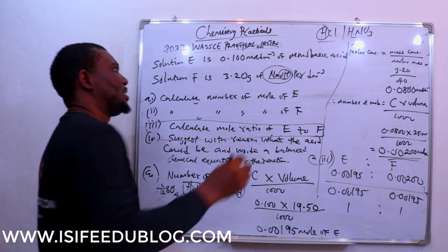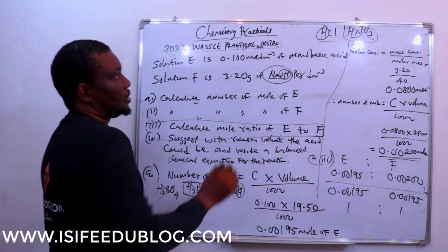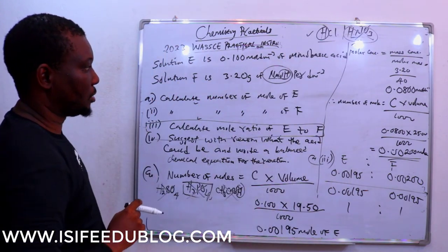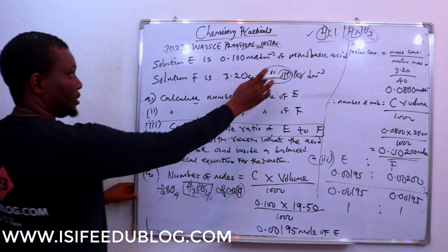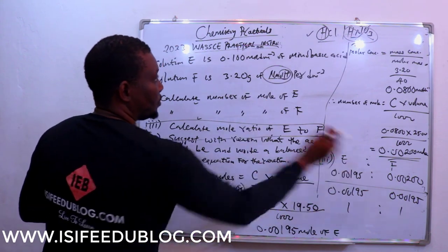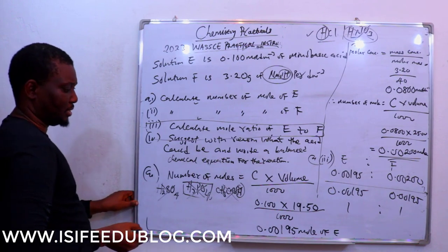But because of the oxidizing potential of this, I should also rule this one out, and then maybe suspect it to be hydrochloric acid. So even if you look at the reaction, you see that these two will give you ratio 1:1 because it's very simple. You just need this, so you don't need to add more numbers.